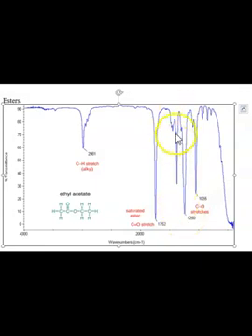There may have been other peaks included in here that were just diminished, okay? That's why it's a little harder to read these over there. So just remember that C double bond O tells us we have a variety of things. In this case, we know that it's ethyl acetate, or ester. That also means ester. Now, if we look, the previous structure was ethyl acetate, but this one is ethyl benzoate.